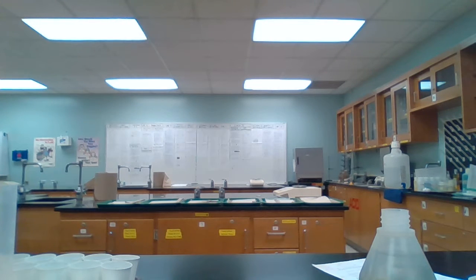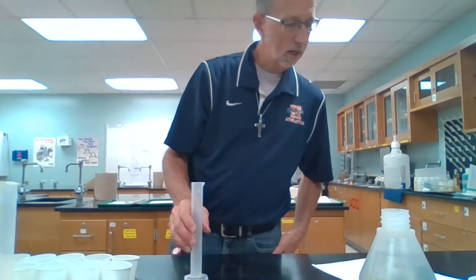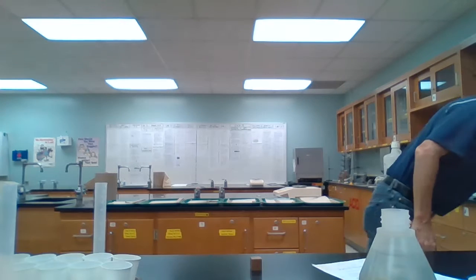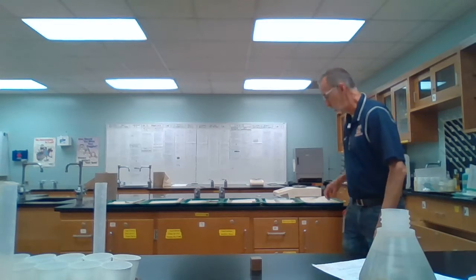Pour the water out there. Put my copper here on the paper top. All right. Number 2. Okay, so copper number 2 is actually a rectangular solid. We can find its volume directly. So let me grab a ruler over here.